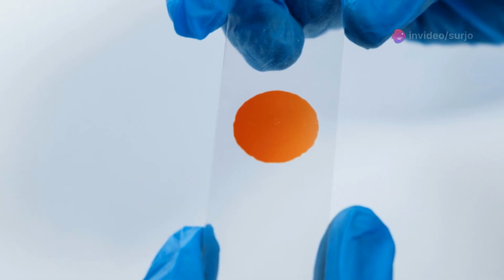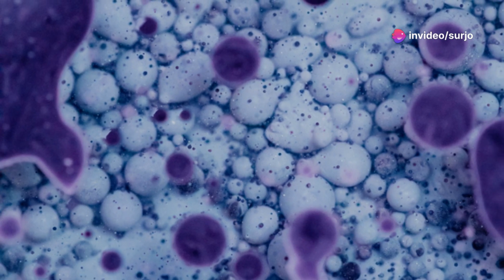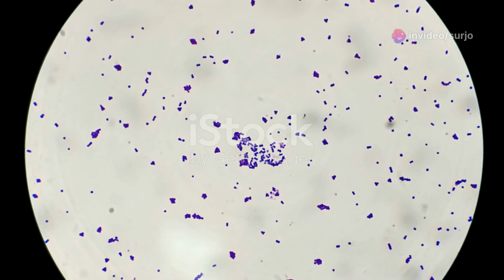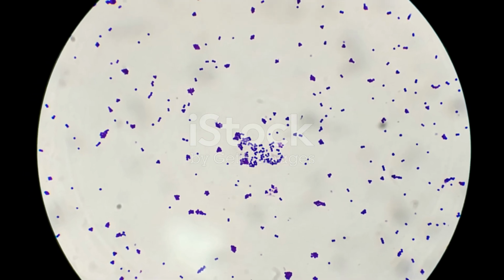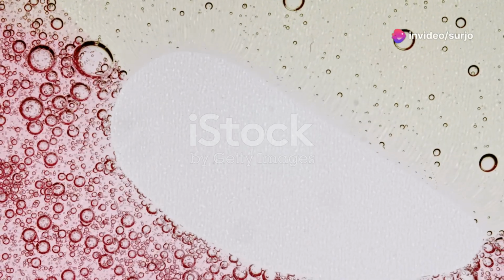Next, iodine, a mordant, is added to the smear. Iodine forms a complex with crystal violet within the cytoplasm of the bacteria, enhancing the dye's affinity for the cell wall. This complex is more difficult to remove from Gram-positive bacteria due to their thick peptidoglycan layer.